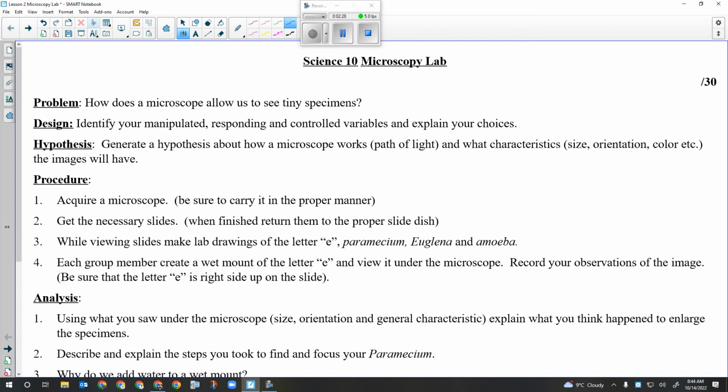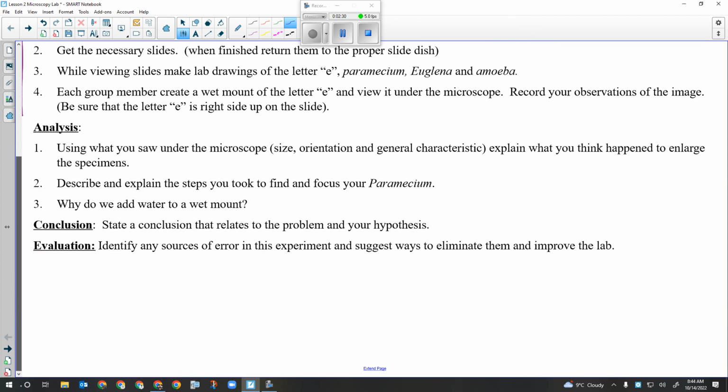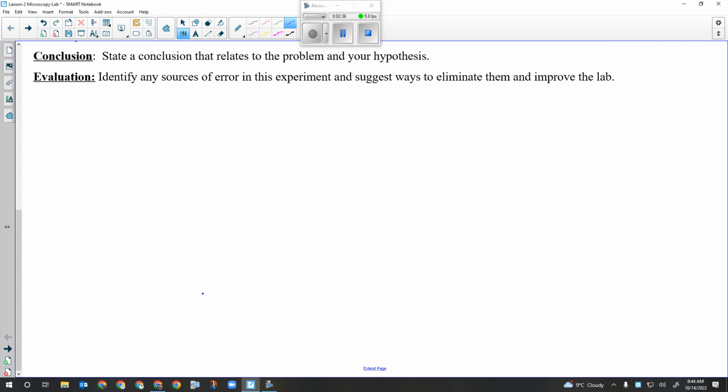All right. So generally, a microscope works like this. You have a specimen, and let's say it looks like this. You have a series of lenses, which I'm just going to simplify to be a single lens, so a curved shape, or a curved piece of glass. And then you have, that's an eye. I'm not an artist, clearly.